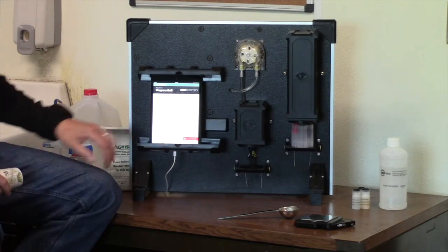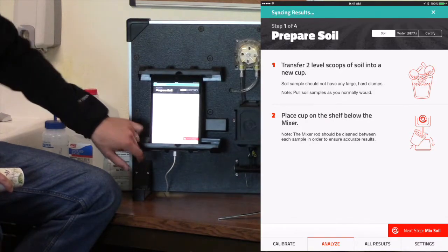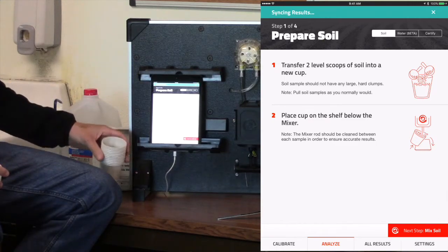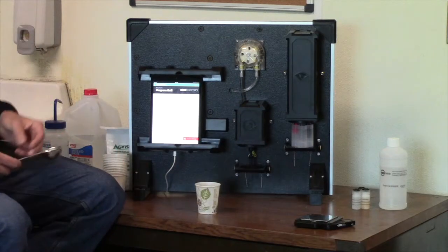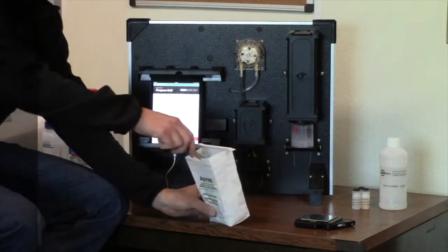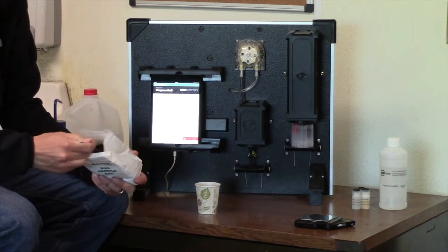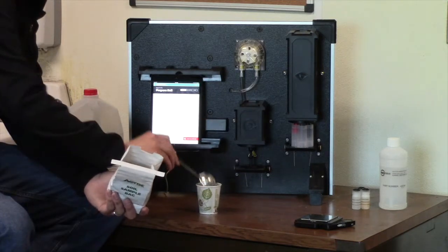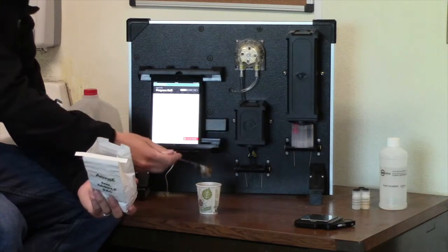The first step in doing this is to make sure we are on the Analyze tab within the 360 soil scan app. If you are in the Analyze tab, you can start by reading the instructions on the screen, which will run you through what I'm about to tell you. Number one, you're going to grab your soil scan and your sample, and you're going to do one of two things. You're either going to use the scoop provided to get 2 full scoops of soil, just simply 2 level scoops. Once you have the scoops, place them in the 5-ounce Dixie cup.